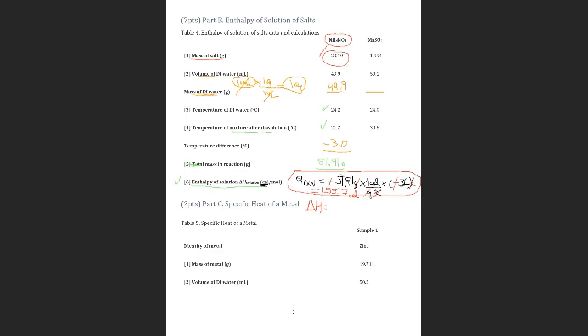enthalpy of solution is the heat of the reaction divided by the number of moles of salt. Okay. So then when you get a number, you can compare. In my case, let's say I got 6200 calories per mole. Because this is what they are asking.